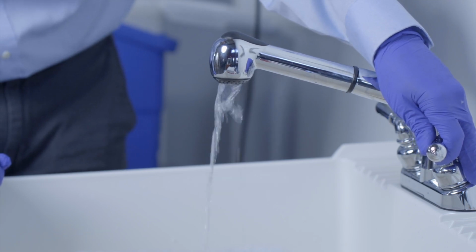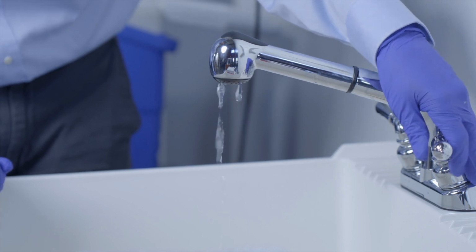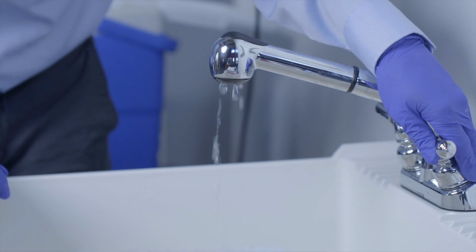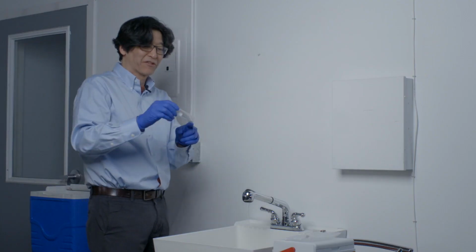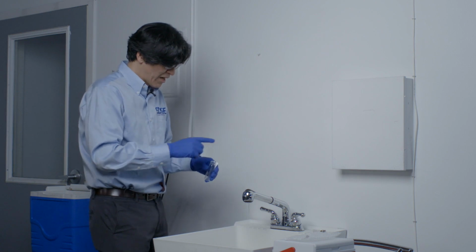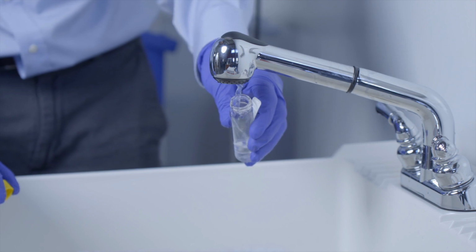So now we want to get our sample to a nice, steady stream about the size of a pencil. This faucet isn't really cooperating with me. Here we go, right about there. So I'm going to take my vial. Remember, we have some ascorbic acid in the bottom. We don't want to run this out. We want to run the water down the edge of the vial to eliminate as much agitation as we can, and we're going to just fill it all the way up.